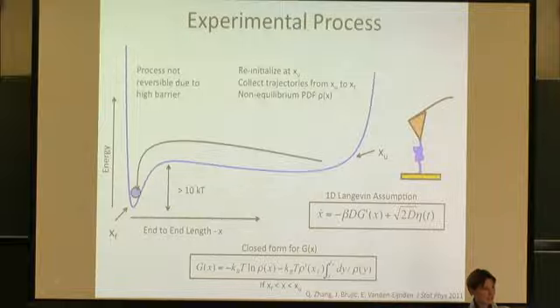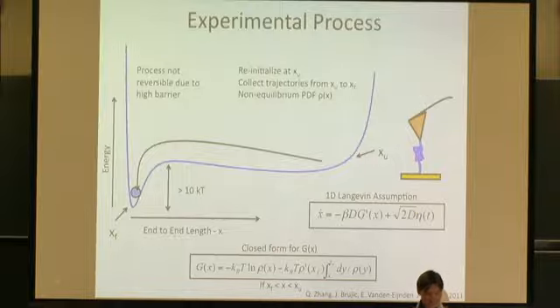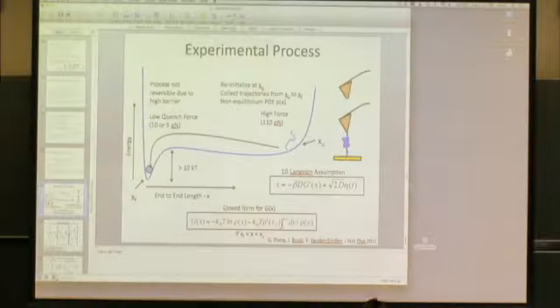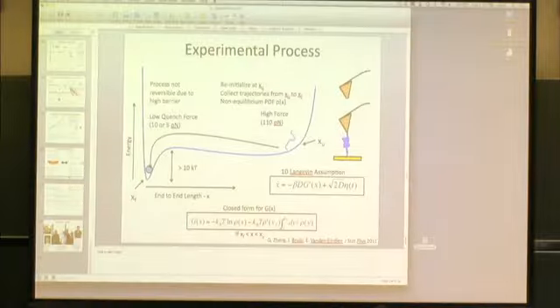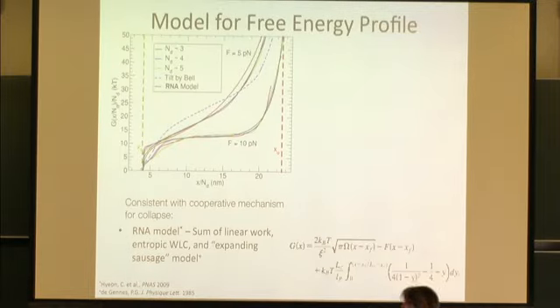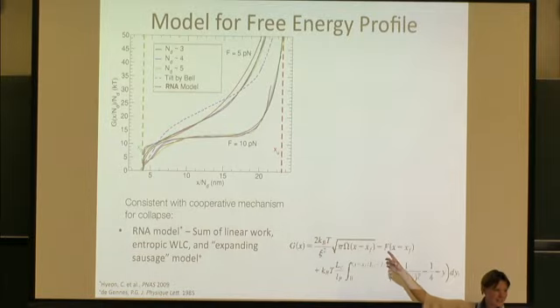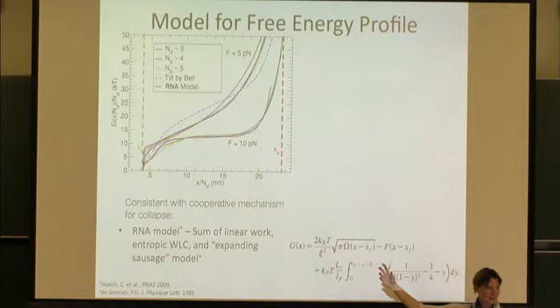Is that a good fit? So if you take your fit to that model and draw from it, do you get curves that also look like the data? I understand the question now. That's the difference between, I don't know if you can tell, the black line is the fit, and the colored lines are the G of X from the data. So it's a good fit.